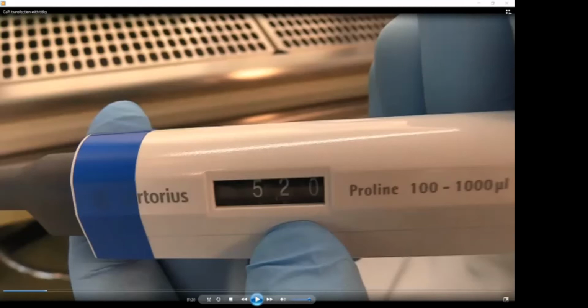When we have 12 samples, because 4 different samples times 3 is 12, we have to prepare solutions for 13. Why 13? Because these pipettes are not very accurate, and therefore it's always useful to have one sample as a backup. So we are calculating everything for 13 samples.